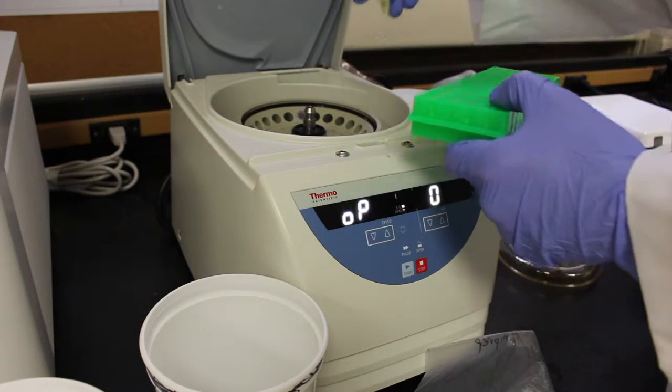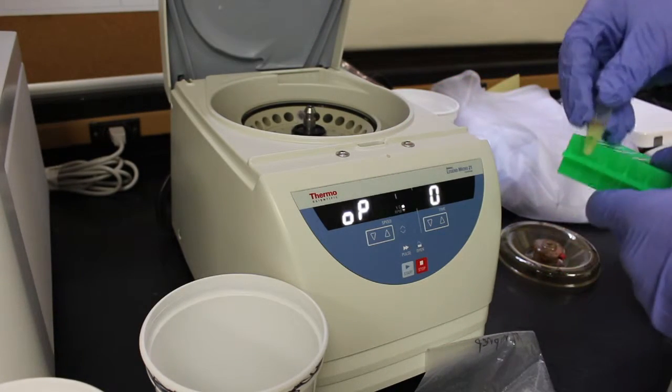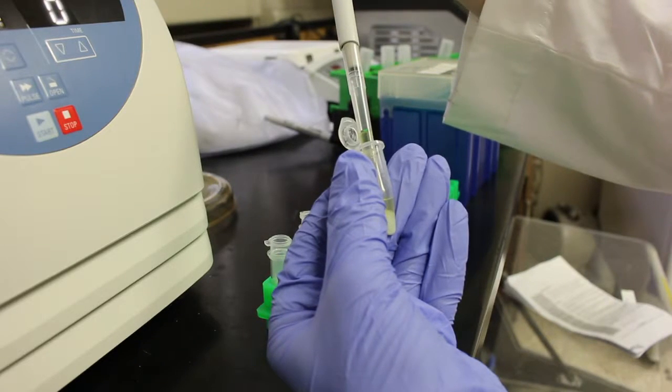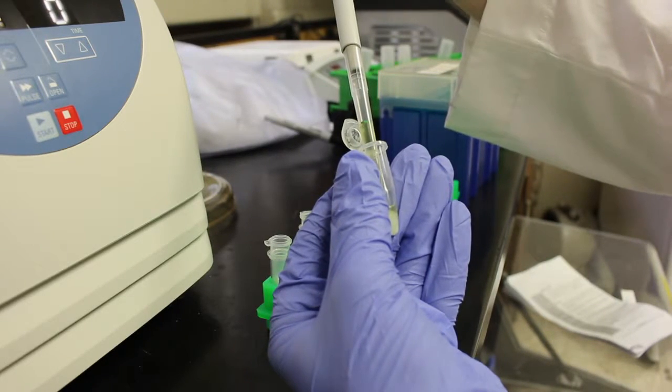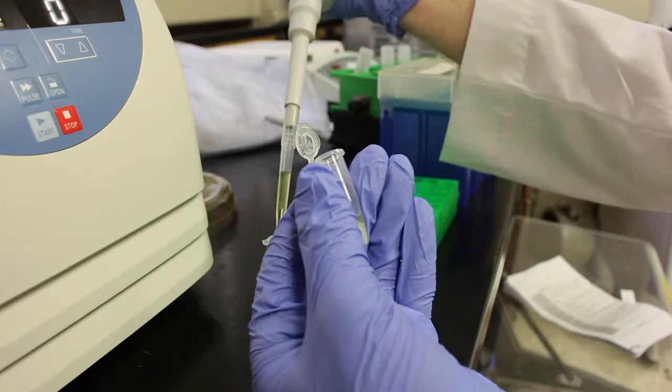Centrifuge the tubes at 15,000 g's for 2 minutes and add the supernatant to the Zymo Spin 2N column. Remember to label the collection tubes before transferring the DNA.